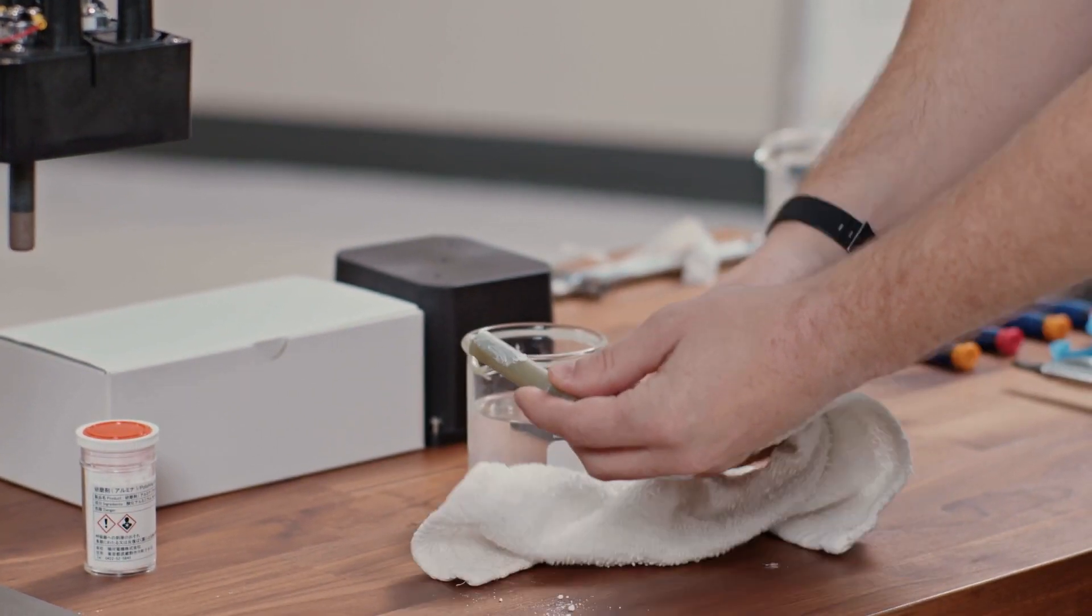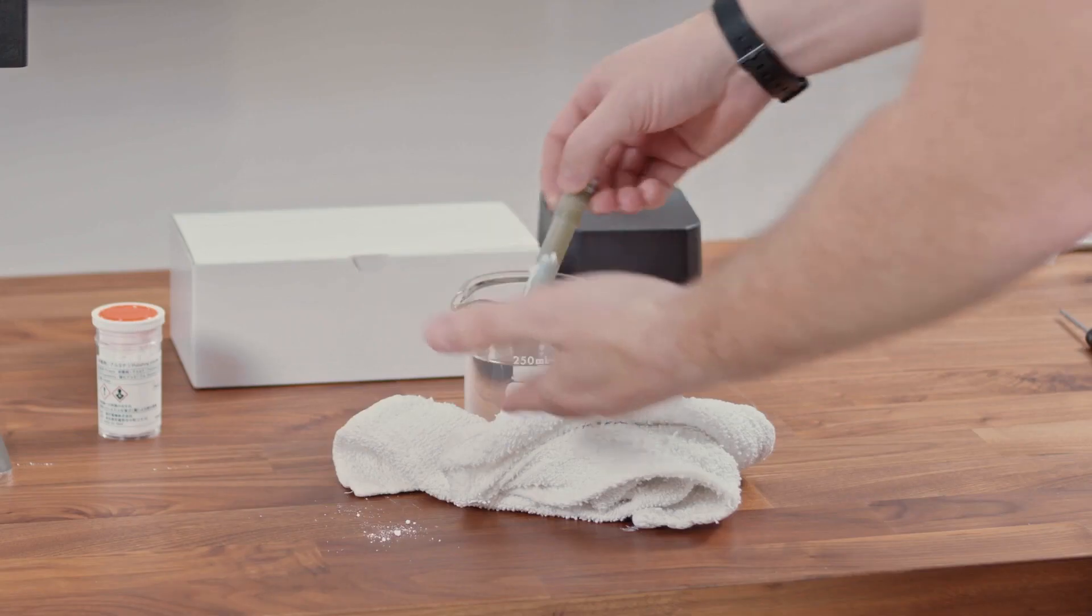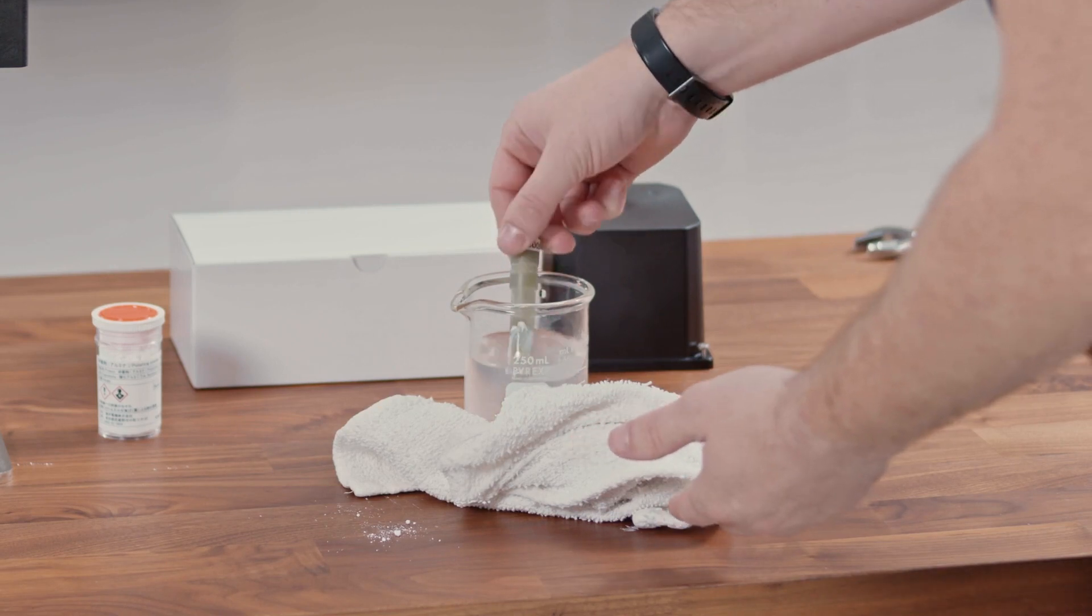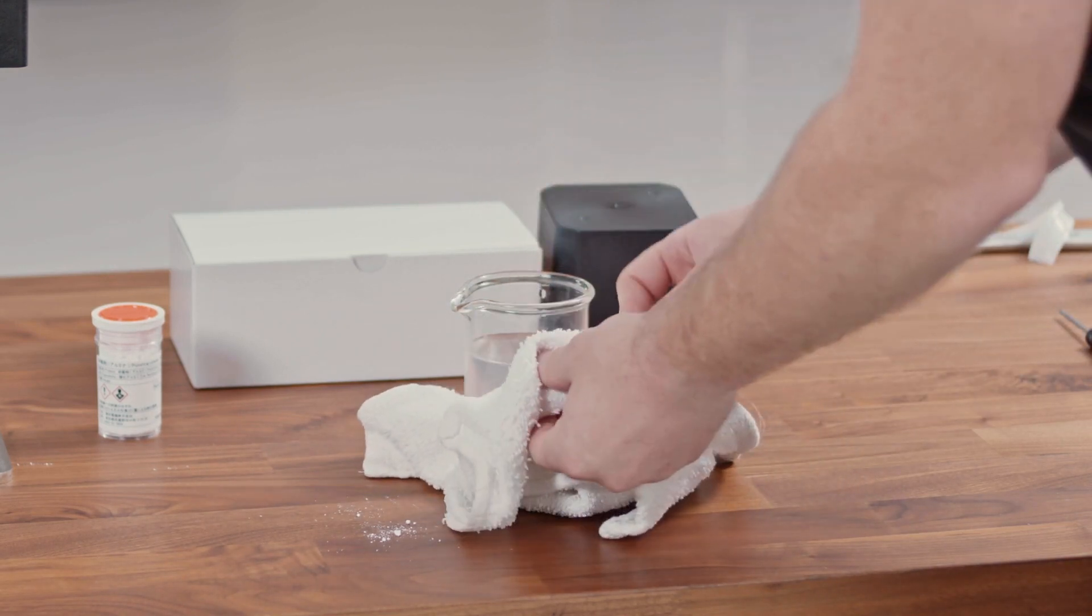Once the electrode is smooth, you can rinse off the electrode and make sure you're removing any alumina oxide powder because this can be hazardous to people.